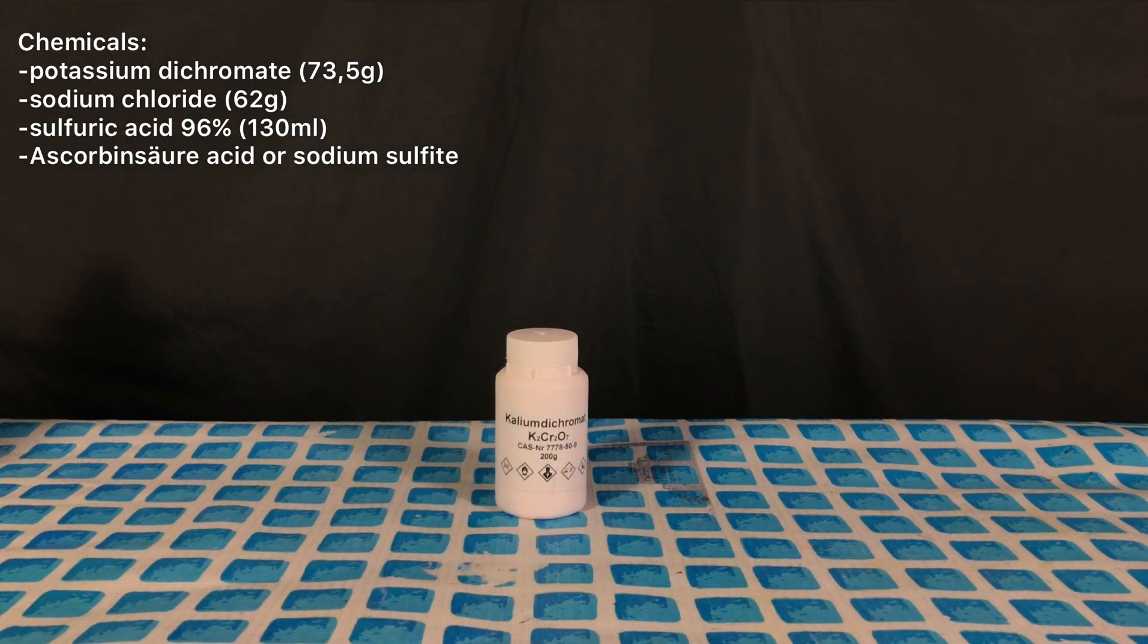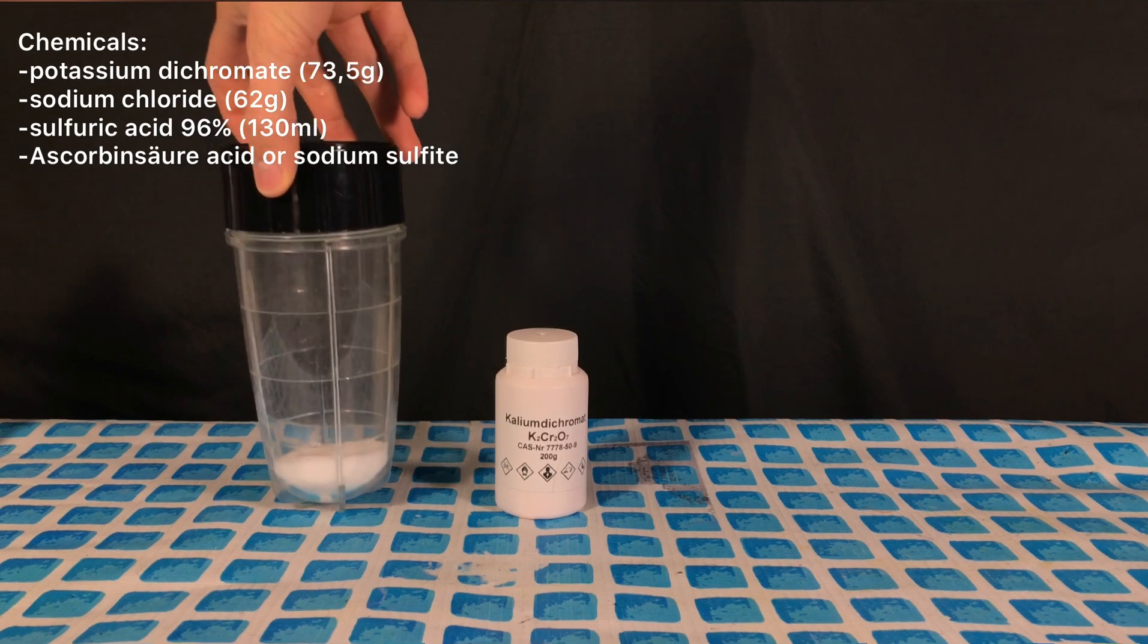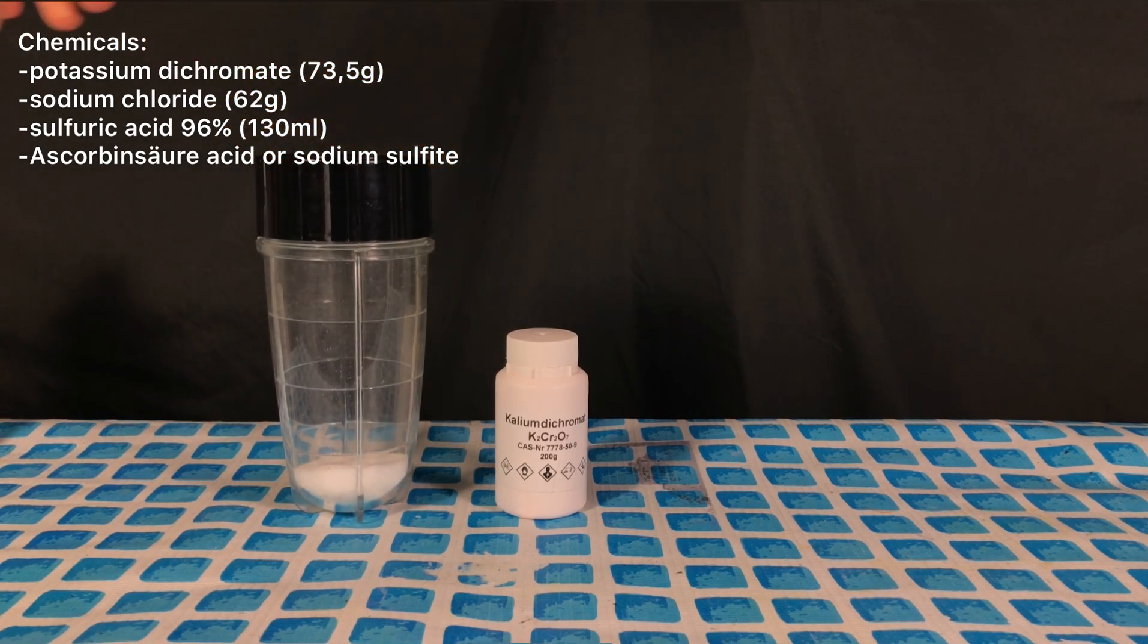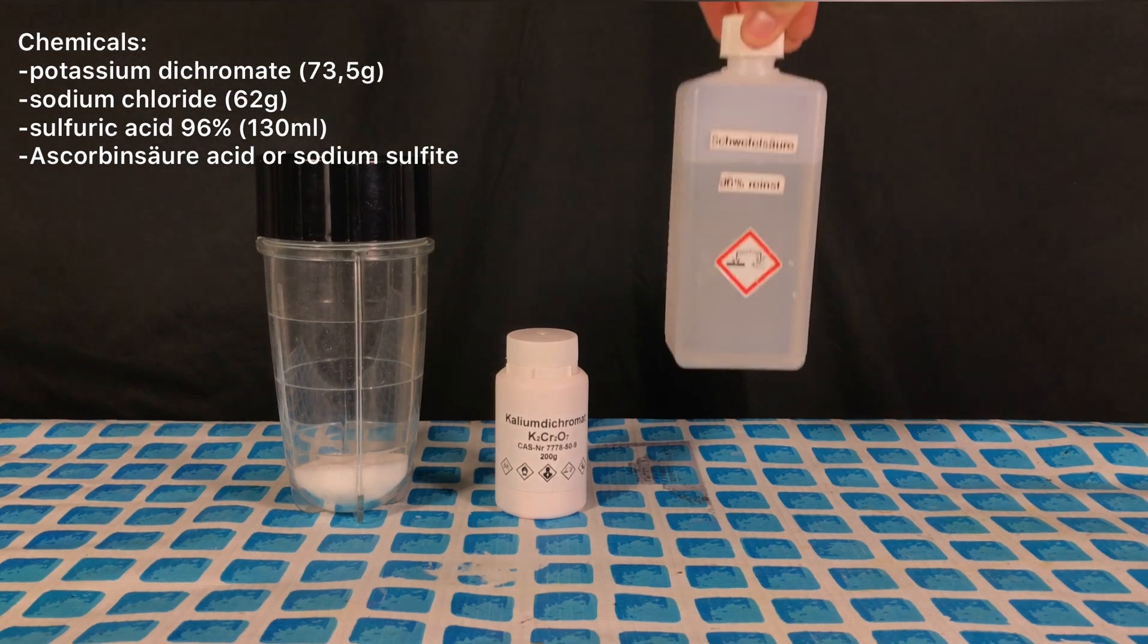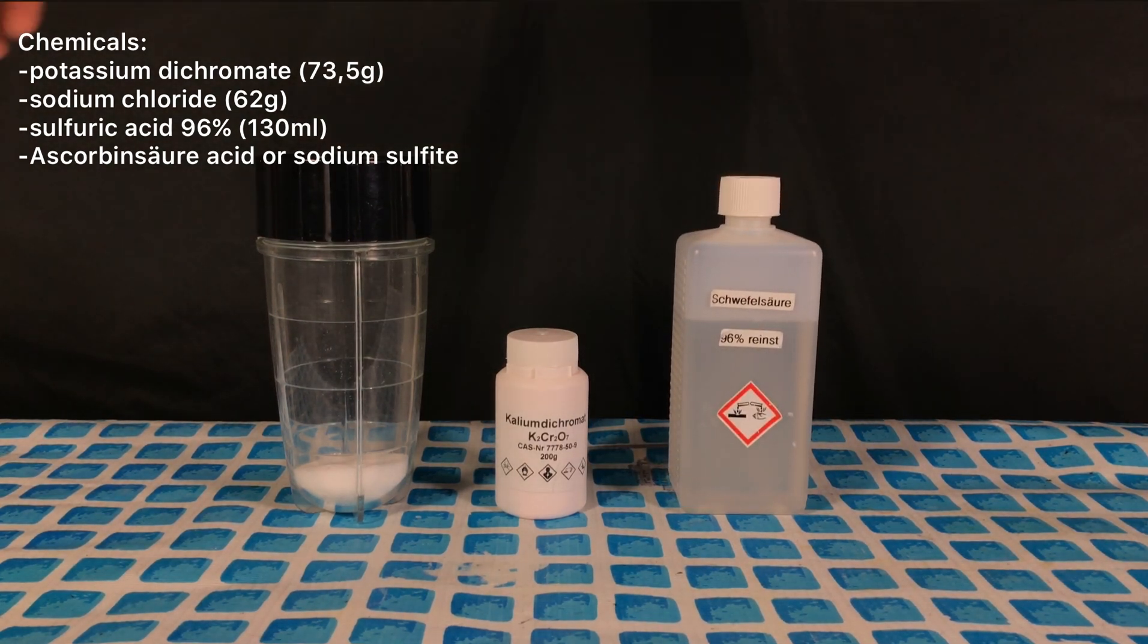Welcome back everyone, today we are going to make chromyl chloride. For this, 73.5 grams of potassium dichromate, 62 grams of sodium chloride and 130 milliliters of sulfuric acid were used.